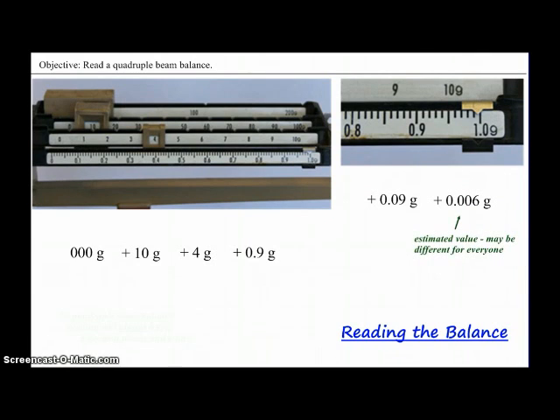Remember that this is an estimated value. It's going to be different for different people, so if you thought it was going to be a 4, whereas your partner next to you thought it was going to be a 7, that's okay, you just need to agree upon a number as what it's going to be for your data. When we put all these numbers together, we have 0 grams plus 10 grams plus 4 grams plus 0.9 grams plus 0.09 grams plus 0.006 grams, we come up with a reading of 14.996 grams.